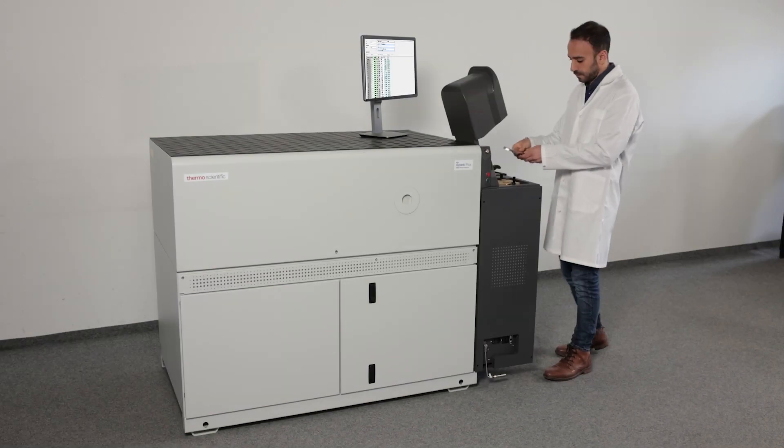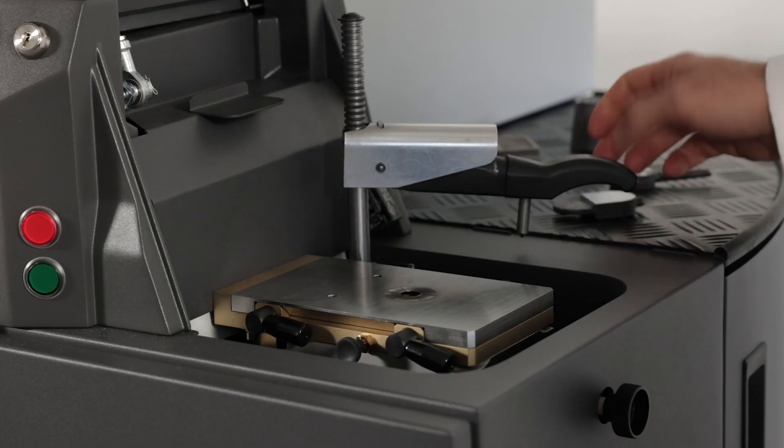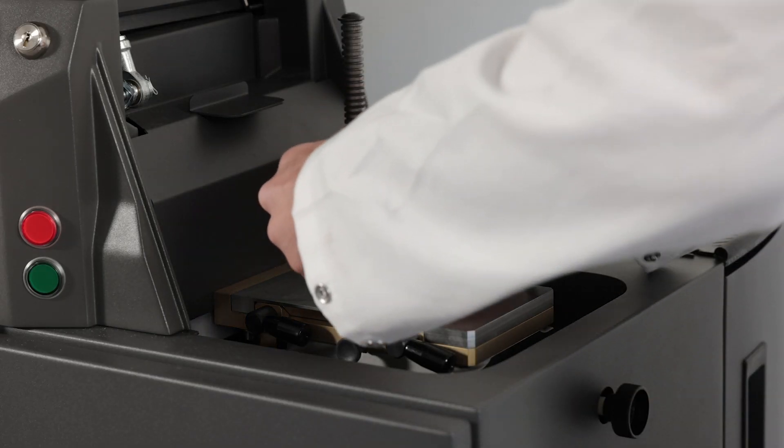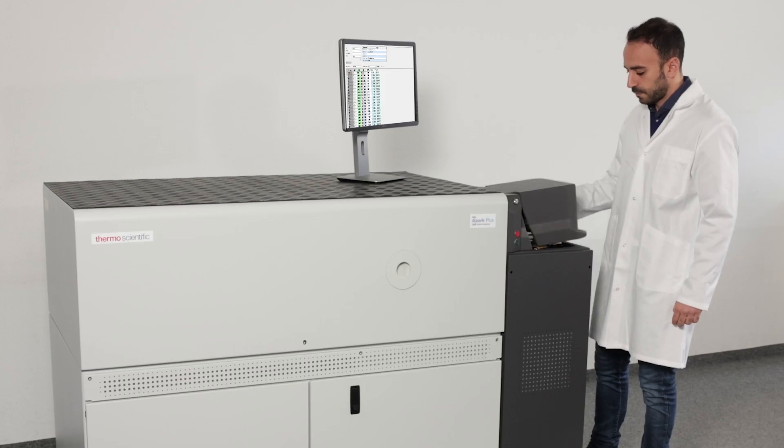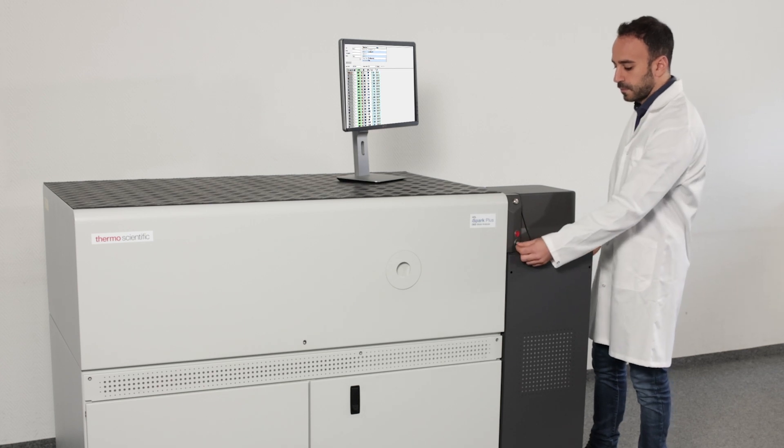Spark Optical Emission Spectrometry is the most widely used technique for elemental analysis of solid metallic samples. The ARL iSpark Plus excels in every aspect of this process.